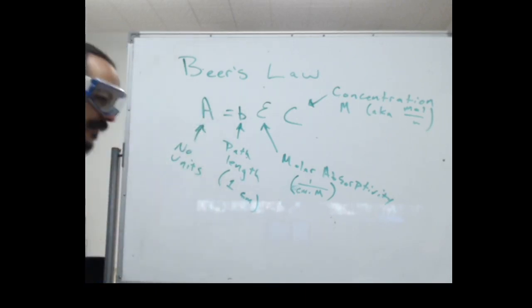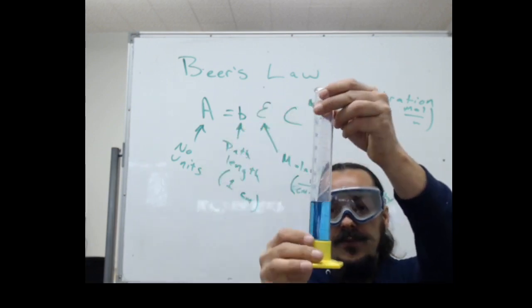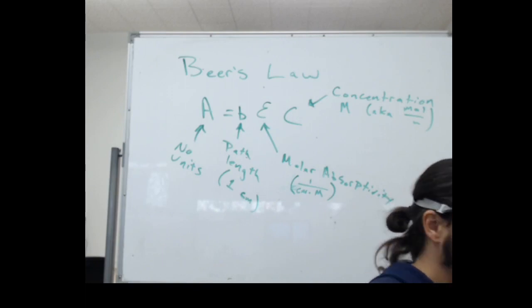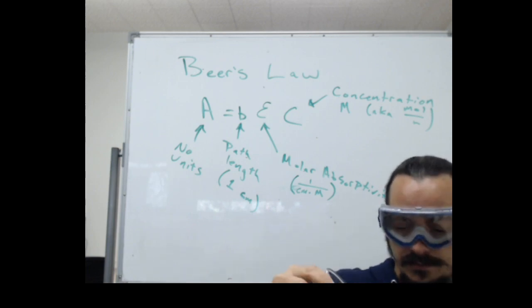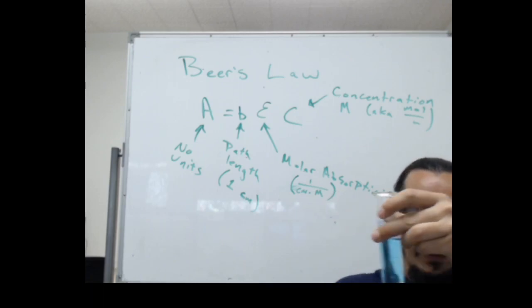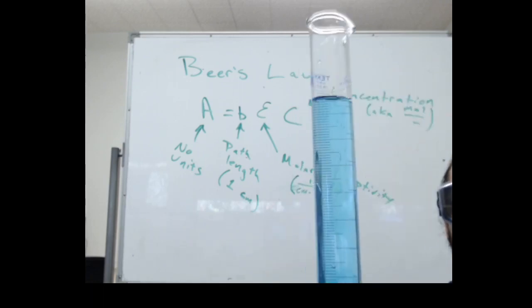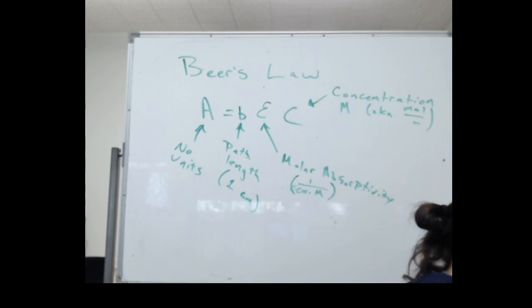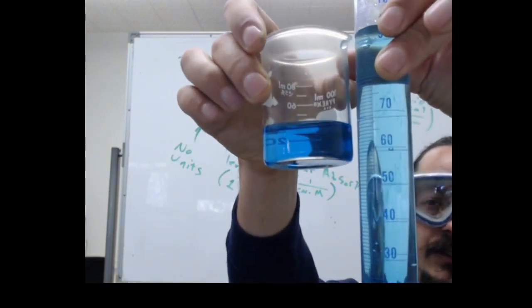And we can think about this, again, in terms of these solutions. If you look at this, I can try to change the concentration. So let's try diluting the concentration a lot. I'm going to add a whole lot of water. And I don't know if you can tell on camera, because as I'm looking at this just in front of me, the color has gotten a lot lighter by comparison to this much higher concentration situation.